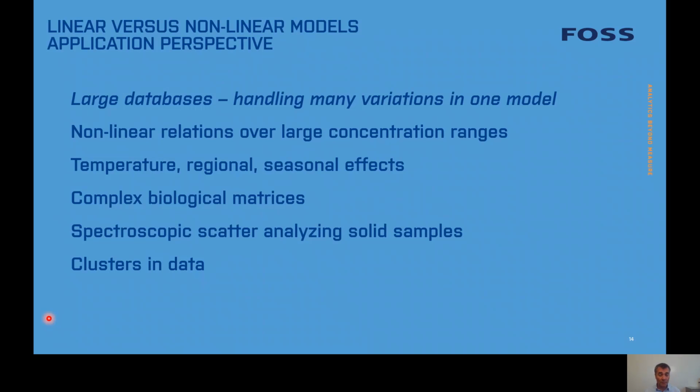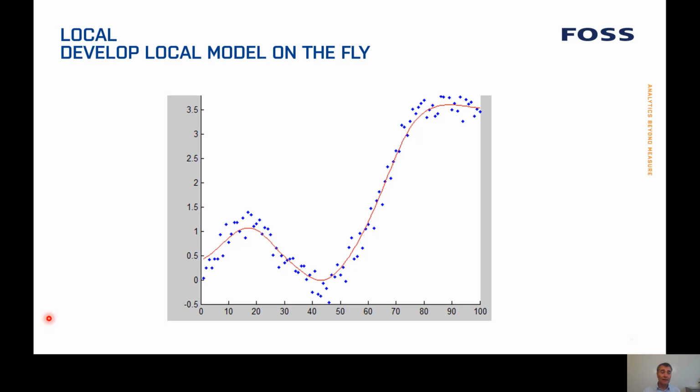So all in all, we have this complex situation with complex matrices that calls for nonlinear models. And one way of handling nonlinearity is to make local models, local linear models.